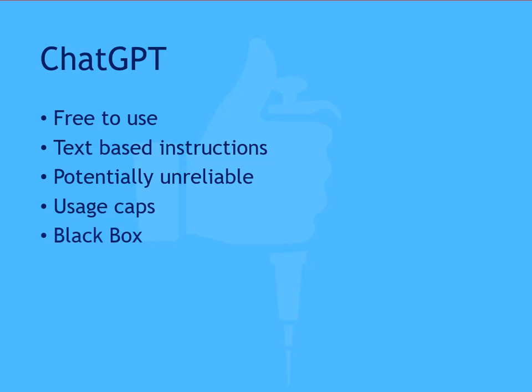The analysis performed by any AI system is a black box. It's not possible to understand how or why any action is taken in response to a request. In ChatGPT's presentation of the data, it's difficult to follow your data through each step of the analysis to identify the well locations and track any sample IDs, and the CSV report contains very limited information.